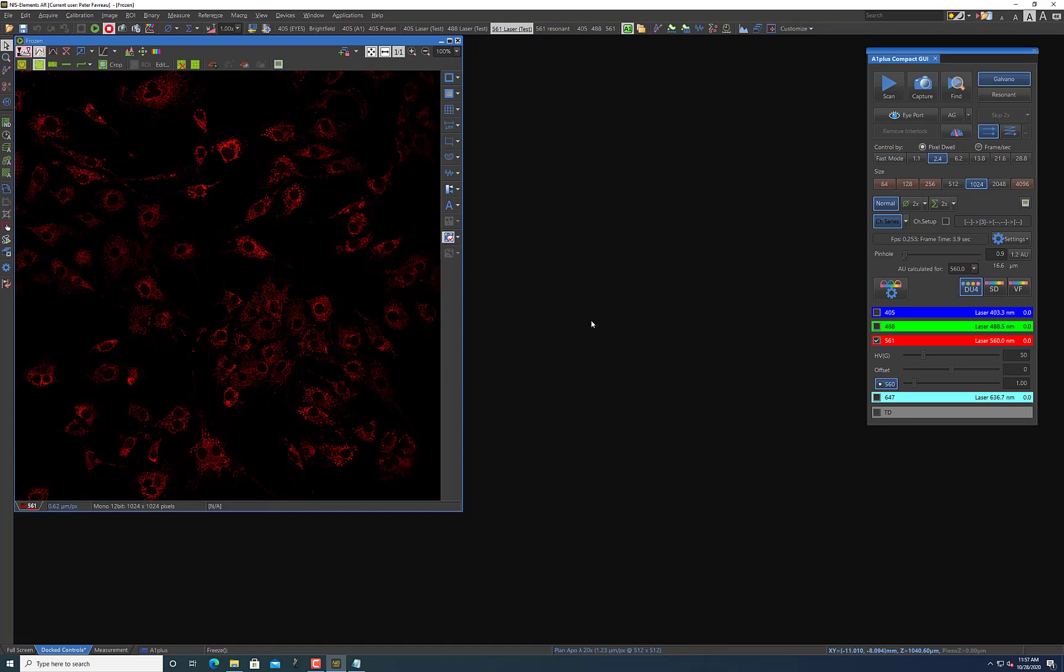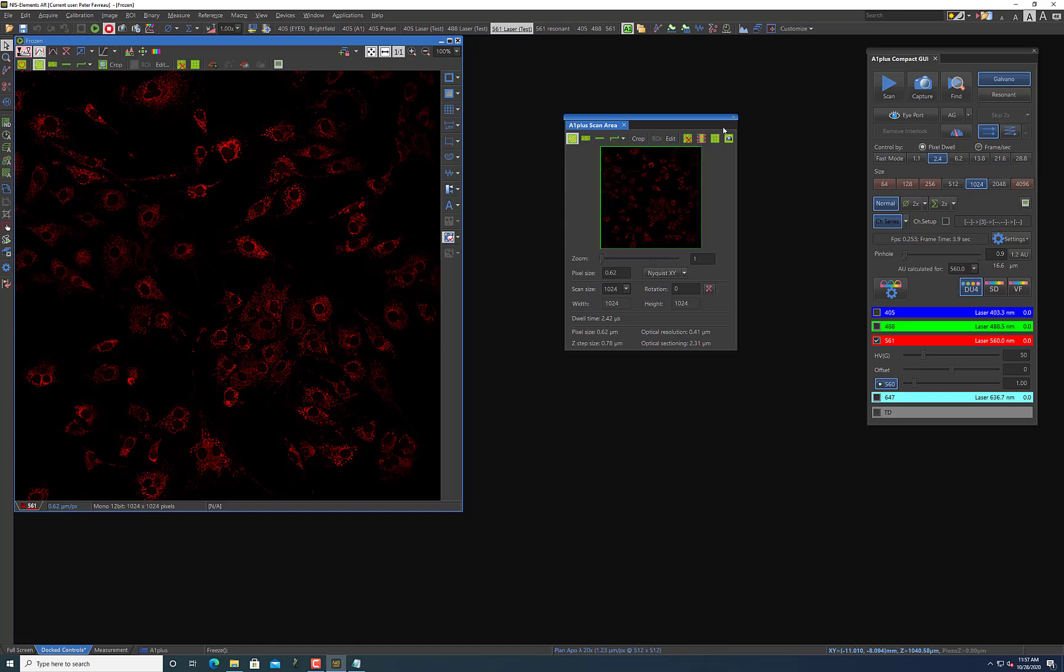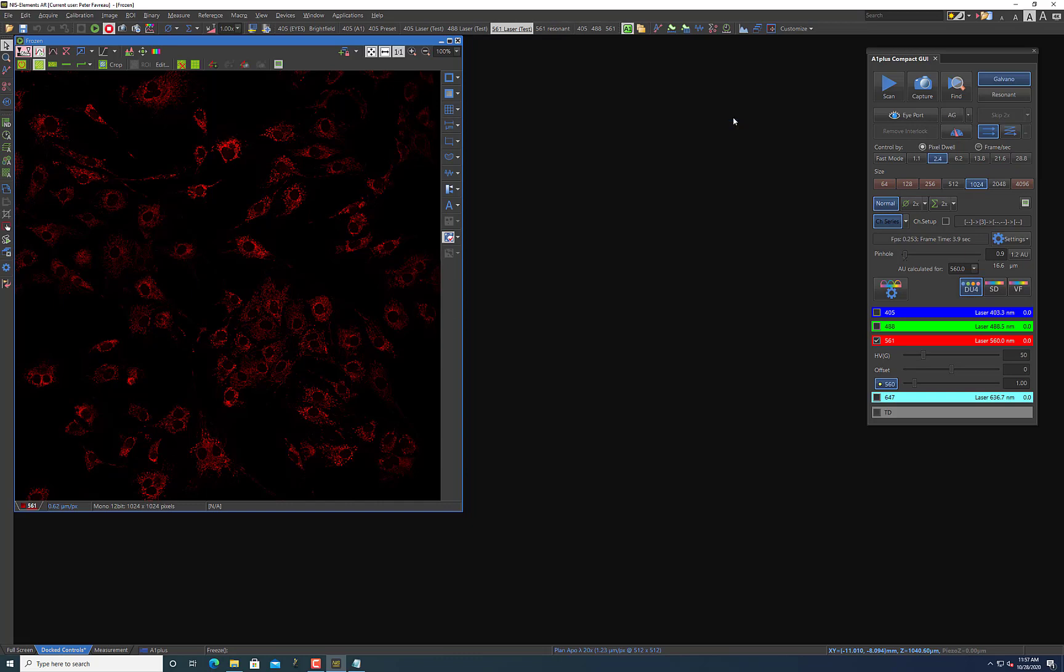You can of course shrink this by going to your scan area by just clicking this button and then lowering your scan area and doing less. But if you just want to find fields of view so that you can tell Elements to jump around to those positions and take images for you, the best way to do that I think is to select resonant mode. So I'm going to select resonant mode here.